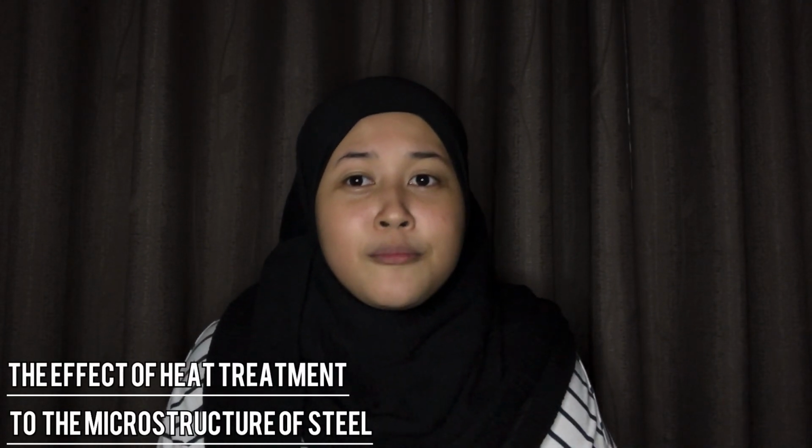For my subject MEC 291, we are given to do an experiment, the effect of heat treatment to the microstructure of steel.